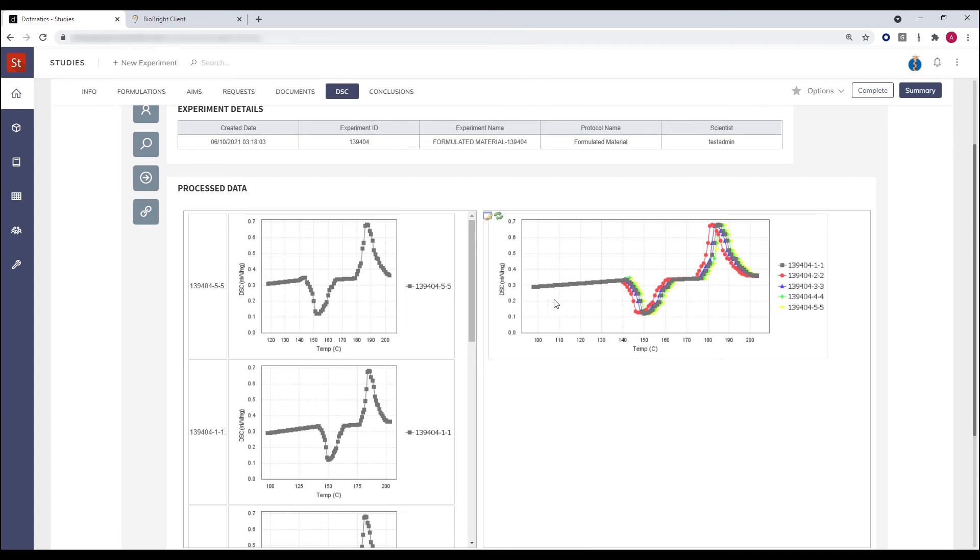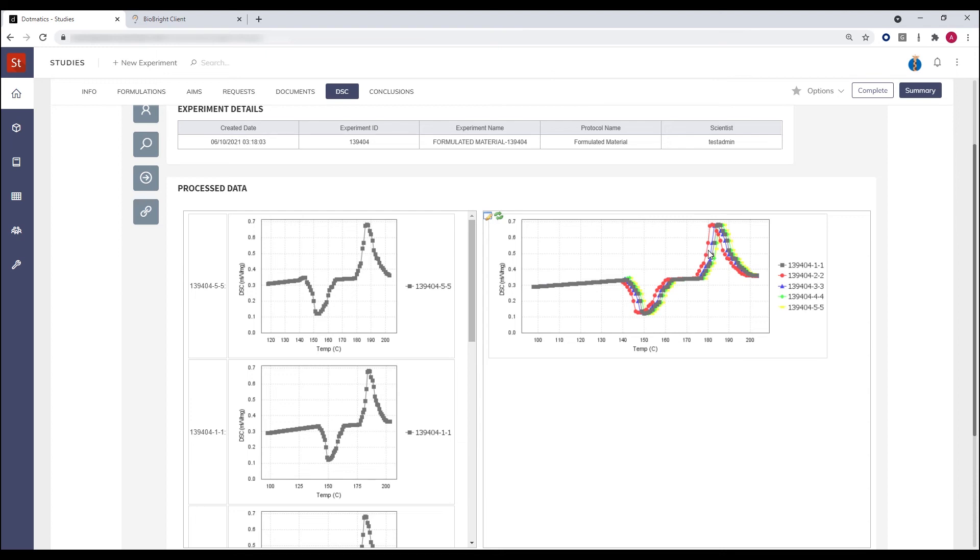In this particular example, we can see sample number two in red has a leftward shift in the DSC trace. This may well be a positive or negative result for this particular experiment, but it allows the end user to visually analyze the results and then annotate the results within the formulations experiment.